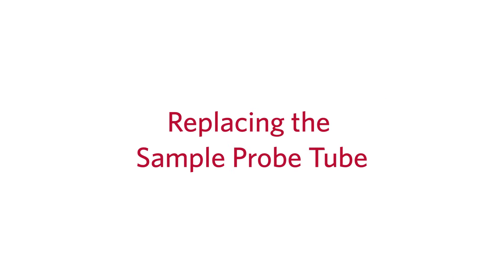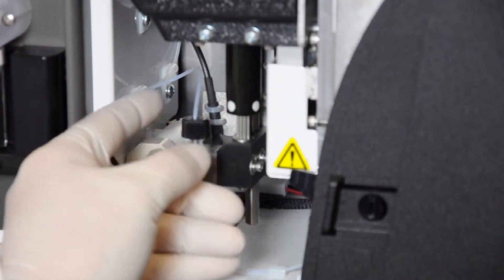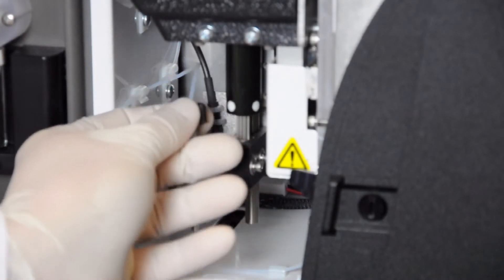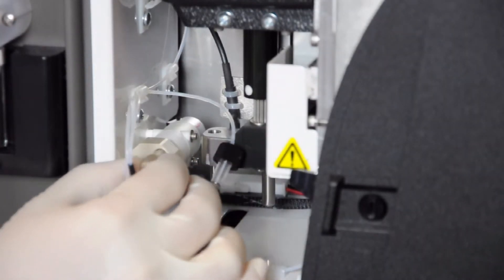We will begin with replacing the sample probe tube. Within the side access compartment, locate the probe assembly and unscrew the black probe fitting completely. Next, unscrew the black flat bottom fitting at the valve end of the sample probe tube. Note: removing the top red fitting first can make accessing and removing the bottom black fitting easier.